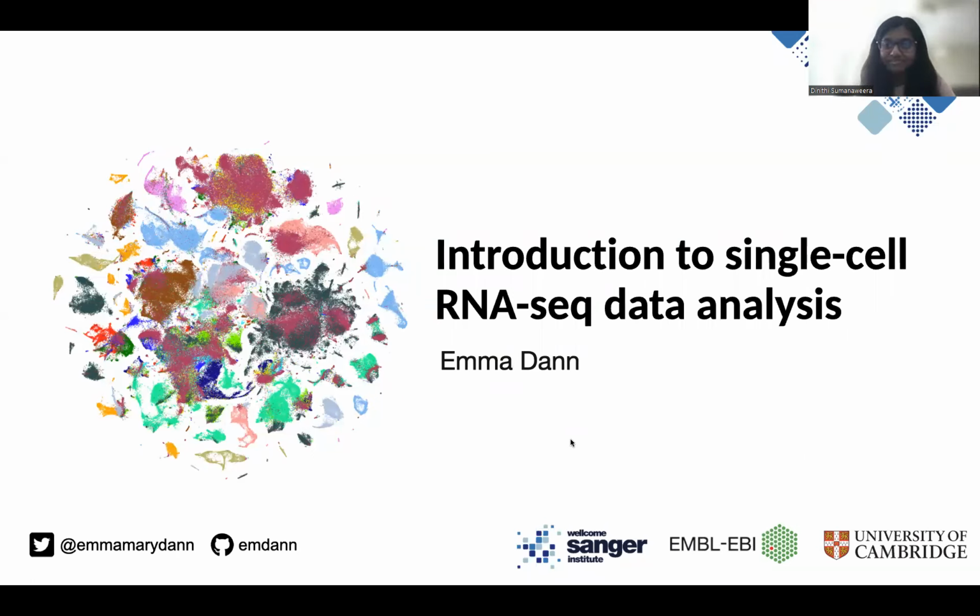Today I will give a fast but hopefully semi-comprehensive overview of the fundamental methods for analysis of single-cell RNA sequencing data. I know that in the previous weeks, you also discussed other types of technologies such as multi-omic and spatial.